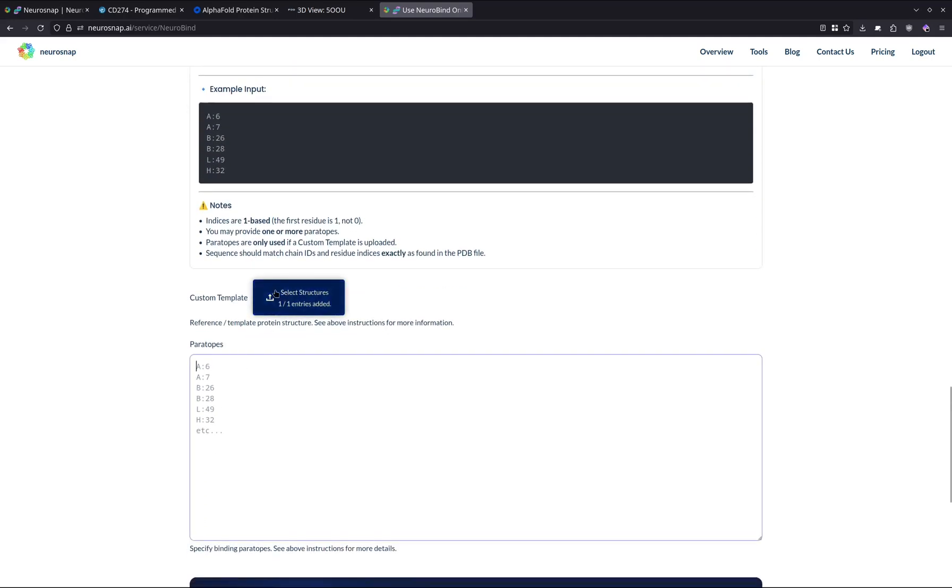And optionally, if you enter a template structure, you can also specify paratopes. You can specify the chain followed by the particular amino acid positions, and this will also help guide the model if you deem it necessary. But this is an optional step as well.